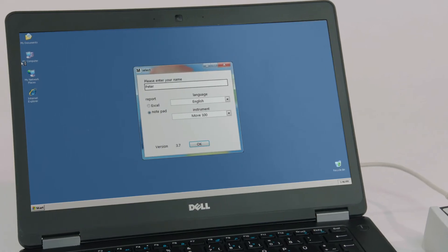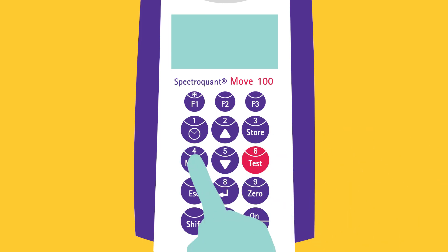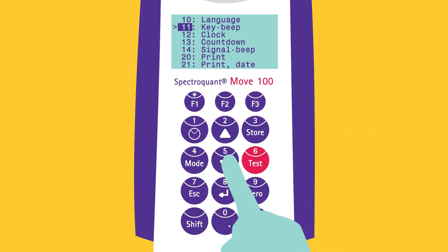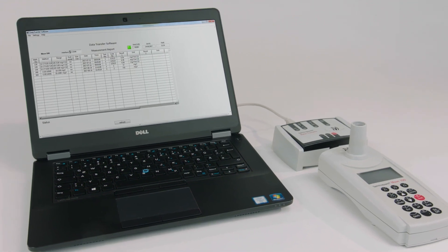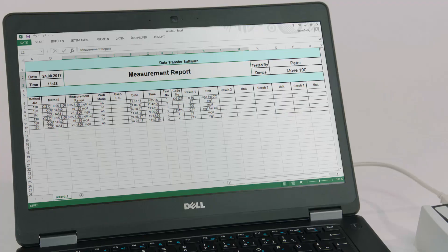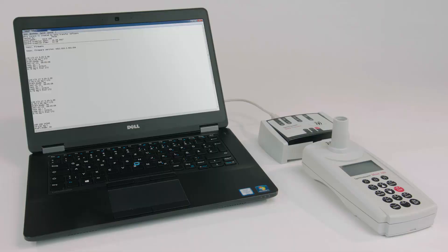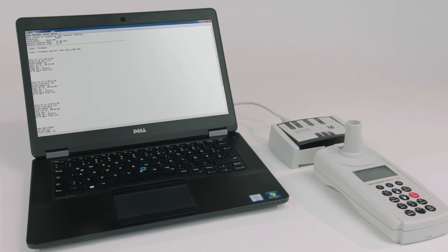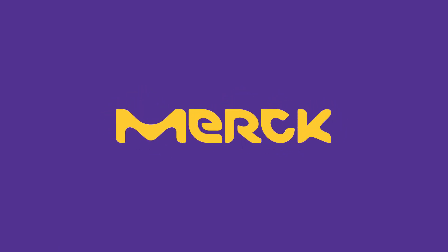You can enter a username when the data transfer software is started. From the MODE menu, choose the PRINT function either by scrolling down or entering number 20. Once PRINT is pressed, the results are transferred to the program. The data can be saved as an Excel or Notepad file, depending on what was chosen in the beginning. From this point forward, the results can be handled as any data.